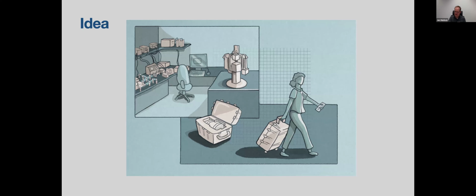And so essentially, this cartoon summarizes the whole journey we've gone through. So we've taken a system off the breadboard, off an optical table, turned it into something more universal, more flexible, modular for us in the lab. But we can even put this in a suitcase and travel with it and share it with collaborators.